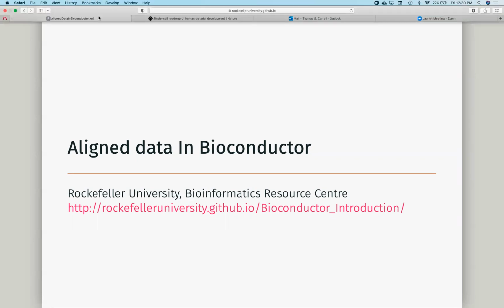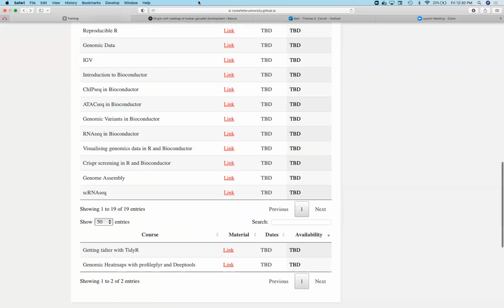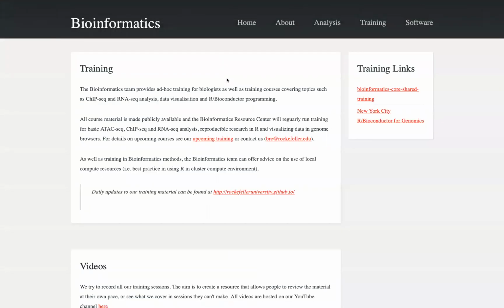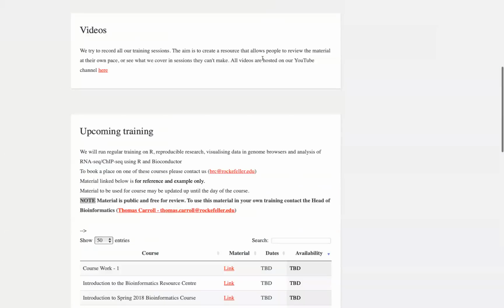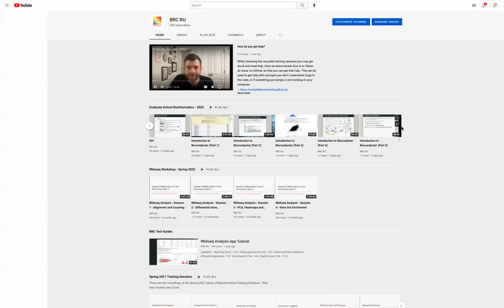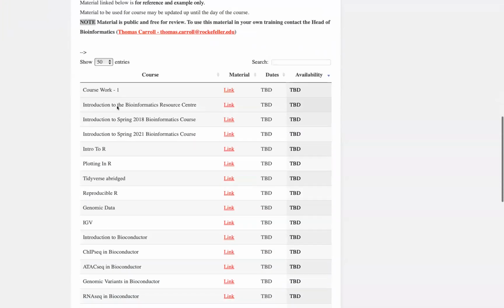We are going to finish off our Bioconductor sessions. So just to remind everyone where we are, rockefelleruniversity.github.io is our page, and there I've been trying to keep up with the videos. I think I've got everything we've done so far up until the last Bioconductor session, which I think was alignment. So now we should know how to align our data.